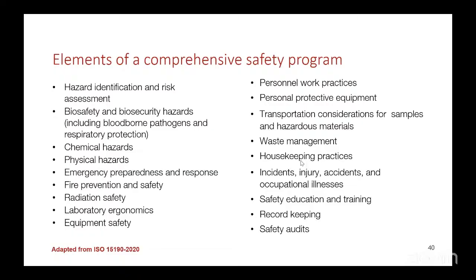When everything has a place, everything will be in place. So have a place for everything so that everything can be in place. So that's what the 5S principle is talking about. You sort, you set in order, you shine, you standardize, and you sustain.